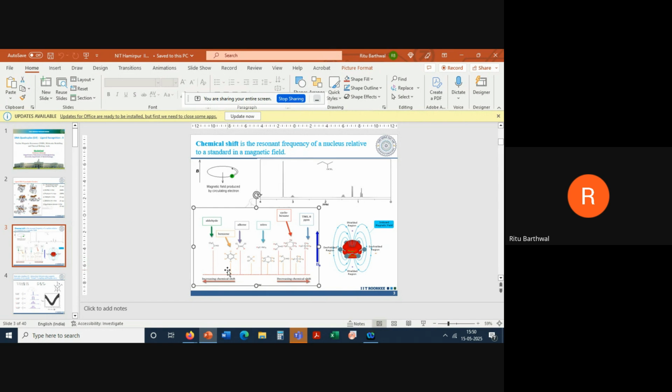So now coming back to this, this is chemical shift, which is actually the difference of frequency that we plot, intensity versus chemical shift. Now chemical shift is mapped on this side, on the rightmost part of the spectra. It is the one which has maximum shielding, the methyl kind of proton. Then methylene kind, then CH will come here, then aromatic CH, and then NH and OH. And our scale is opposite. We write this as 0.